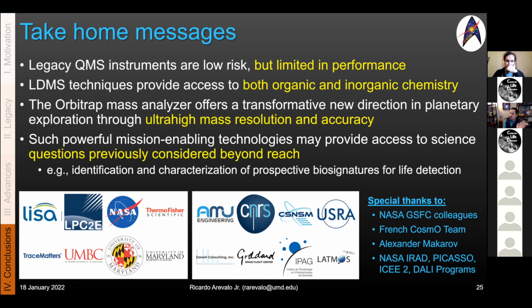She also wants to know what's possible, because we might not have a tuned instrument. So she wants to know, what if there's noise? What if there's more than one ion packet inside? What if you've got space charge issues? She's trying to understand, in the best case, what's the uncertainty on those collision cross sections? Ideally, can you resolve structural isomers that might have really small differences in the collision cross sections? So she's approaching it from a simulation and modeling standpoint.